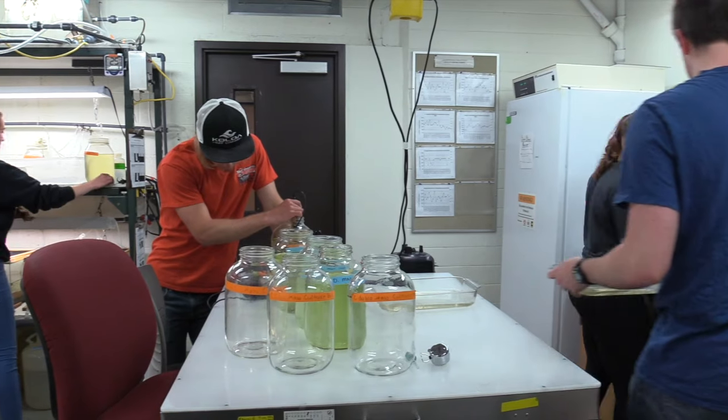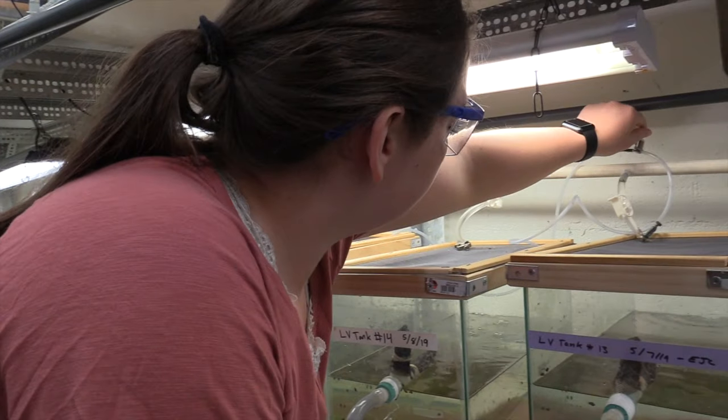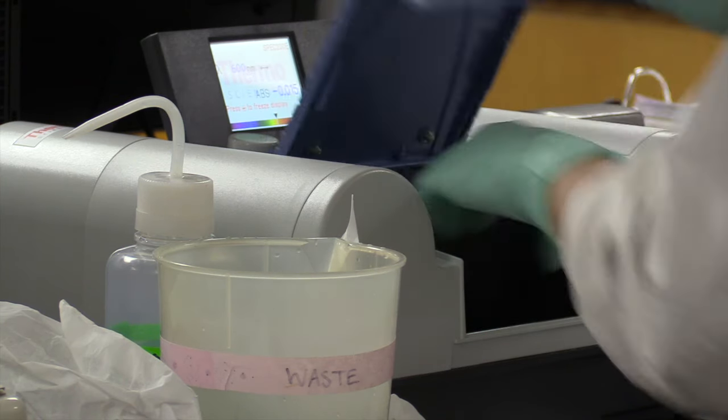Students are very important for everything that we do. I mainly culture organisms in order to ensure their survival for the different tests that are done here at LSRI. You're not going to just not feed your dog one day. Like, we have organisms and they have to be fed and have to get taken care of. So we have to learn how to do that efficiently.